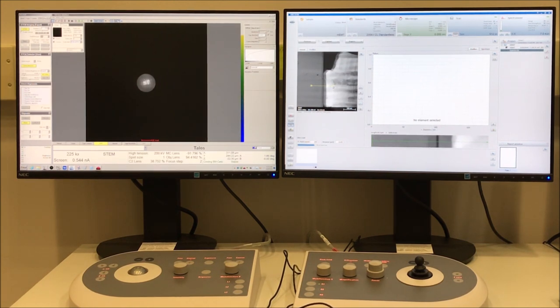So once you have the line positioned accordingly, you can choose how many points are in the line. So you can see above that reference image or that close-up of the reference, you can see how long the line is, and you can then also input how many points are in the line. So obviously you can do the math and figure out the spacing between the points.